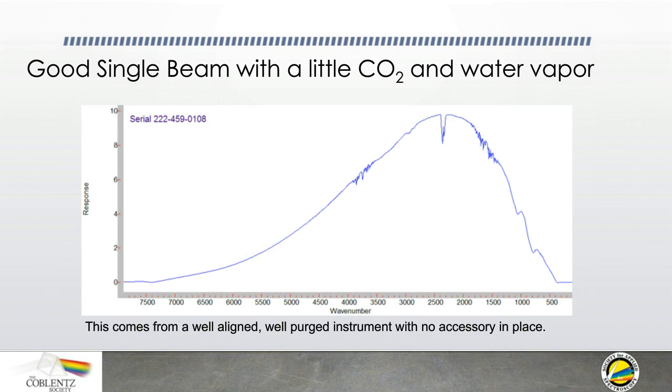I've actually, unfortunately, had the situation where it was the middle of the winter, the power failed in the building, and then the heating system failed. And when we came in the morning, the instrument had turned itself back on because the power came back on, but the instrument would not align properly. We couldn't collect the data. We had to let it sit until it warmed up like all the people in the lab. So from that standpoint, you want to keep it turned on all the time.